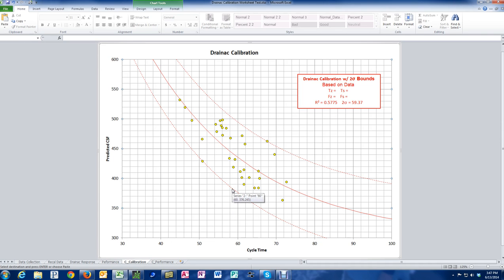You can do more averaging and attempt to reduce the variability. You can try to make sure that your people are processing those lab values as close to the TAPPI 227 methodology as possible to get that tighter and tighter. Basically, I think that if you were to do a TAPPI 227 test absolutely perfectly, instead of having a 2 sigma of plus or minus 60, you might get it down to plus or minus 30. Okay, so this isn't really all that bad.